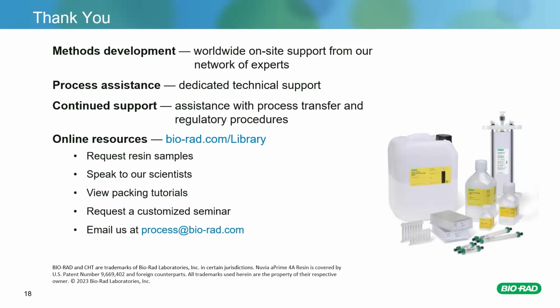This is known as a modeling design, and you will be looking to test between 4 and 9 factors there. The most information about the process interactions can be obtained by using a so-called optimization design, but it is not recommended to test more than 4 factors in this setup.